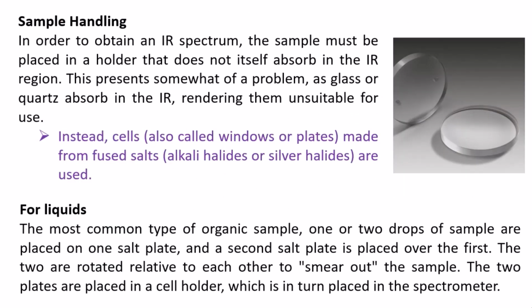Okay, so in IR, before you run your sample, you have to prepare the sample. Now, depending on the sample that you have, it will inform what kind of sample preparation you should go through. So solids are prepared differently from liquids. Now, there's an instrument or equipment that is used to prepare the samples, or an instrument to which the sample is applied to be run in IR.